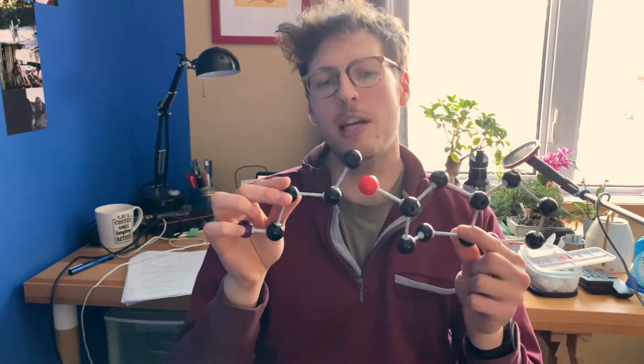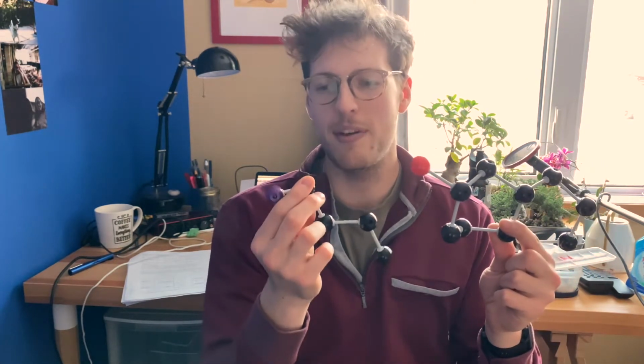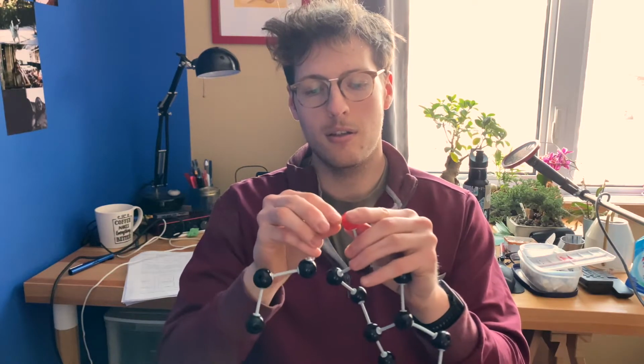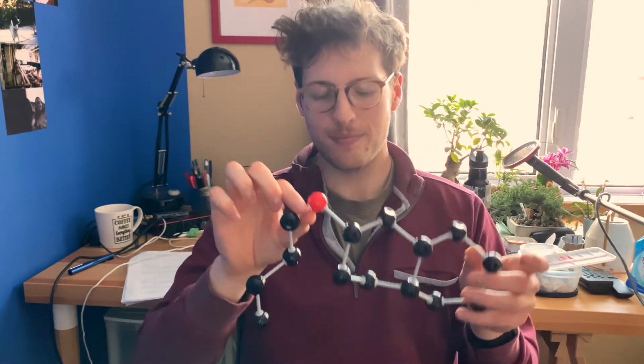So by adding in the iodobutane here, this negative charge is going to be transferred via SN2 mechanism to this carbon here, which will then bump off the iodine into solution. So you'll have a negative ion in solution for iodine. What that looks like is this popping off. So then we get the 2-butoxynaphthalene, which is the flavoring agent. In the solution we have water, positively charged sodium, and a negatively charged iodide.